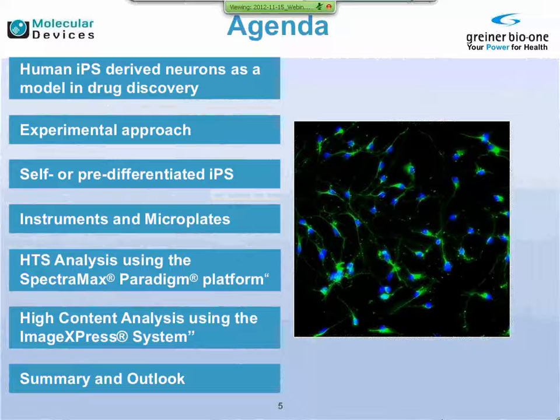So this agenda gives an overview of the different sections of the webinar. We will start with a very short technical summary about the scientific basics of induced pluripotent stem cells and an explanation of why we selected neural cells as a model. Then we will describe our experimental approaches, where our experience in maintaining, growing, and differentiating two human iPS cell lines is summarized.